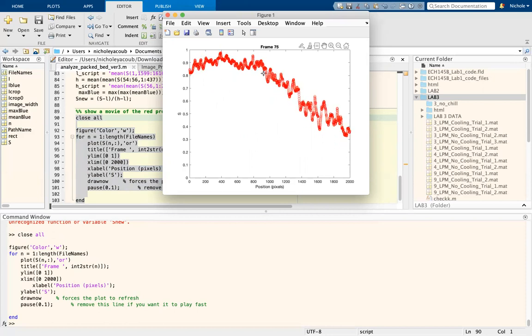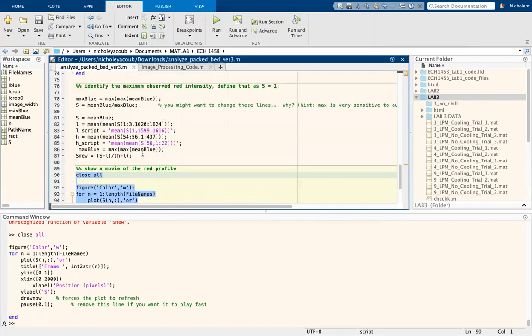And so for me, what I would do is take a range from maybe this point to this point, a good healthy range that includes this outlier, and get an average maximum so that these are actually closer to 1. And that's what we did here. I chose a healthy range from 1 to 437. Remember, your pixel length is actually 2,880. And so you're not necessarily choosing a super large range. Just make sure it's reasonable.